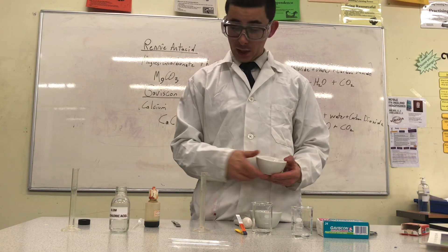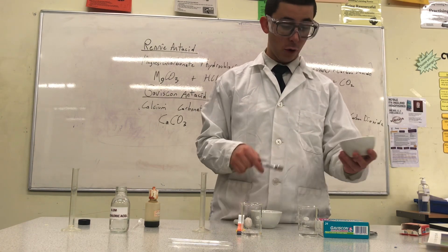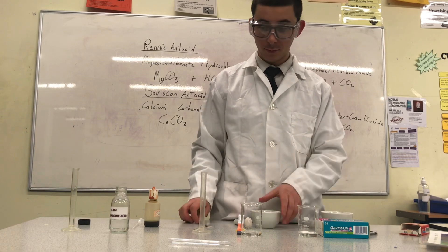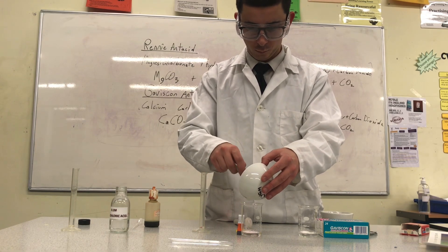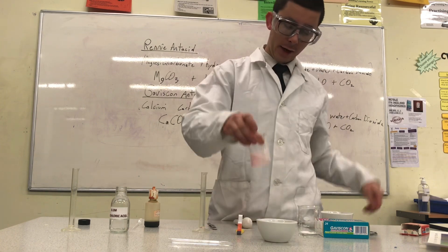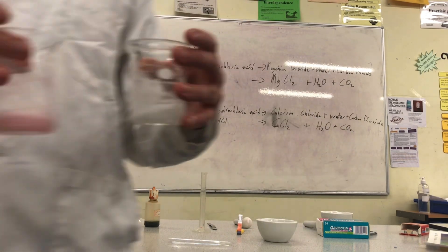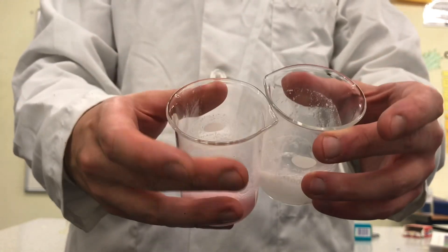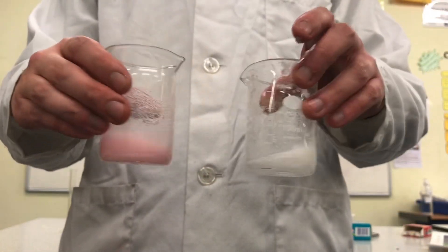I will now add all of both antacids to each beaker of hydrochloric acid — Rennie first, and now the Gaviscon antacid. I can swirl these so that the antacid neutralizes and slightly dissolves. Bringing this closer to the camera, you can see that both are fizzing and releasing a gas. I'll keep swirling to ensure that both are mixed together.